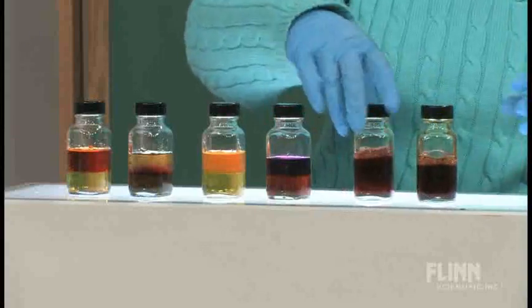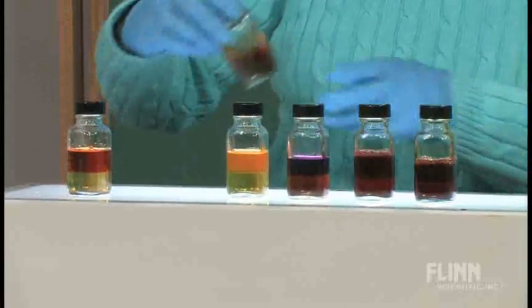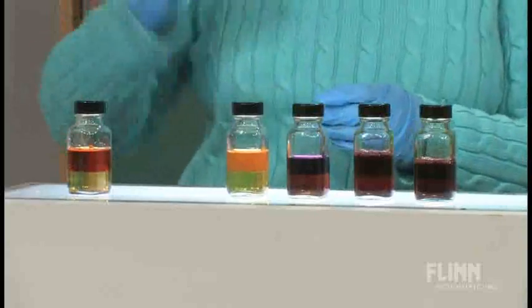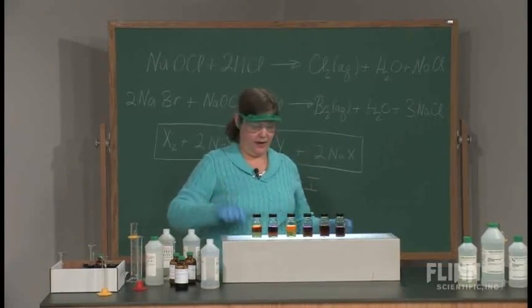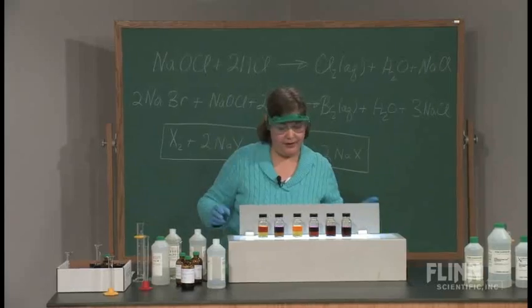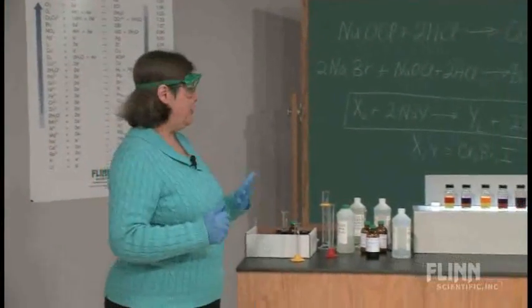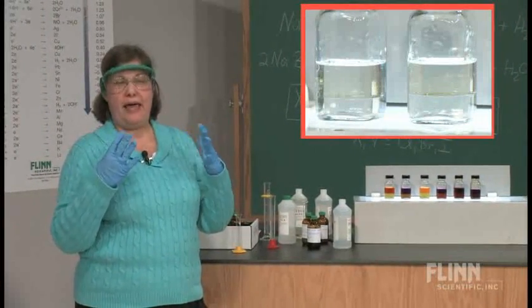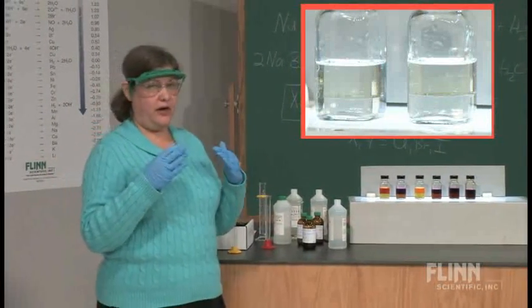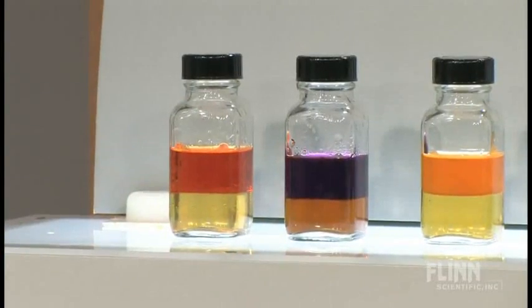Okay. Now, does everybody remember exactly what these looked like? Okay. Let's put that back up there. Remember, the first two bottles contained chlorine water, and we had two very, very pale yellow-green layers, almost colorless. Well, obviously, the chlorine reacted.